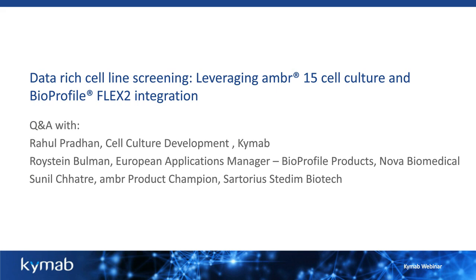For your PCO2 values? PCO2 values. Yeah, so if you see from some of the webinar slides, pretty much the data was quite reliable, and when we ran the large-scale bioreactors, most of our things like the pH and PCO2 matched quite well with the ambr system, so I'm pretty happy with the correlation.